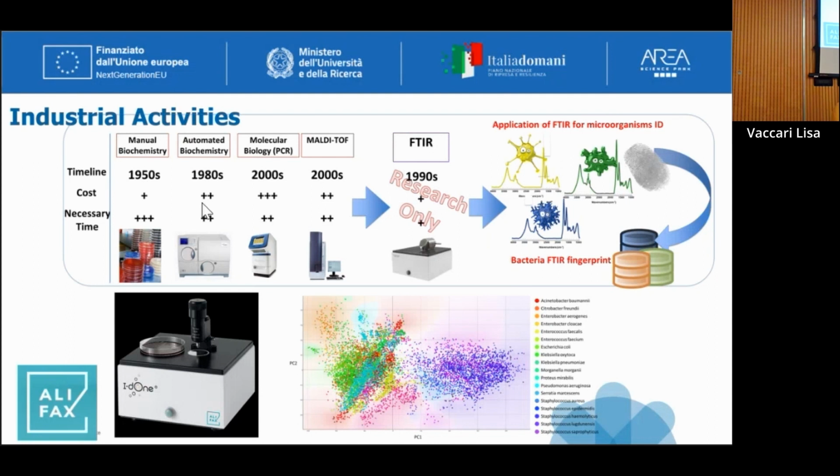So you use mass spec as the gold standard? Yes, but in general, this is bioinformatics. Essentially you build your database, you start with samples that are known, and then you build your space of variables. And then when you have the unknown, you put it in these colored clouds, which means a specific strain.